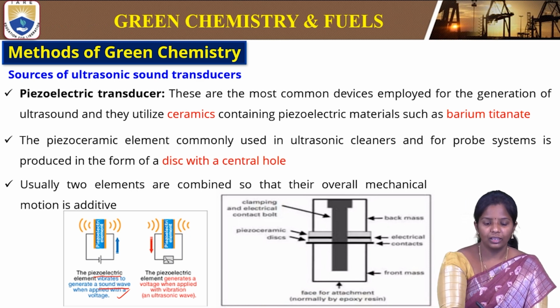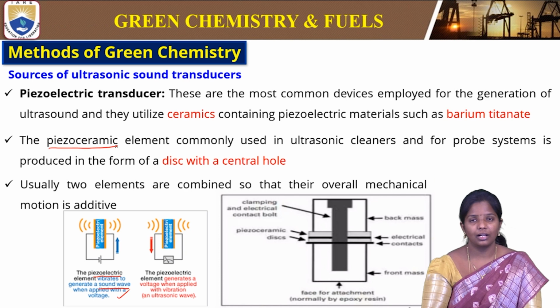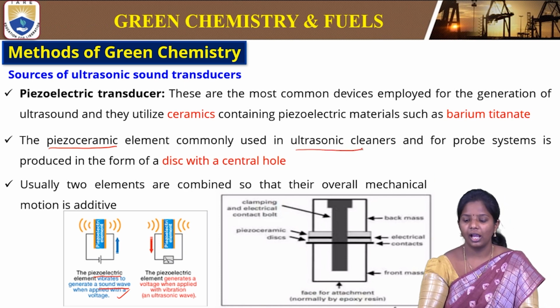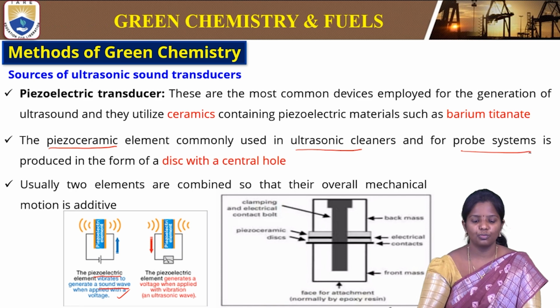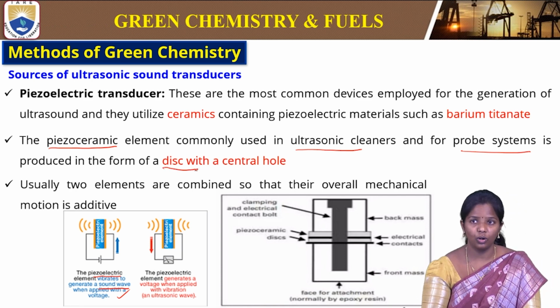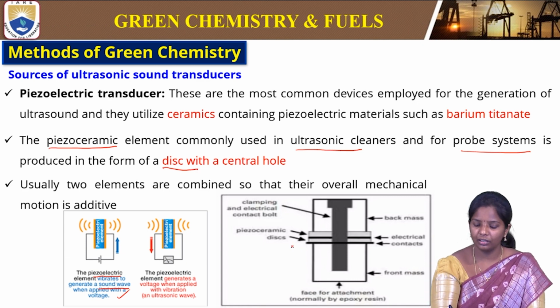The piezoelectric ceramic element commonly used in ultrasound cleaners and for probe systems is produced in the form of a disc with a central hole. So the material will have a hole here.